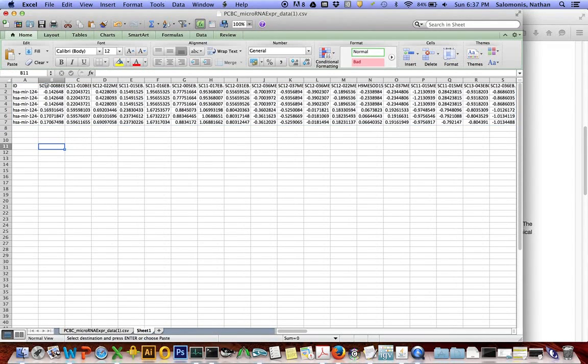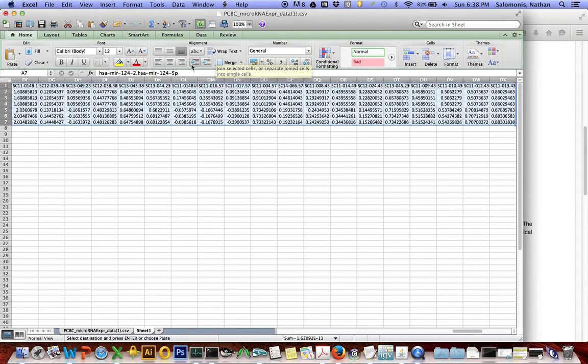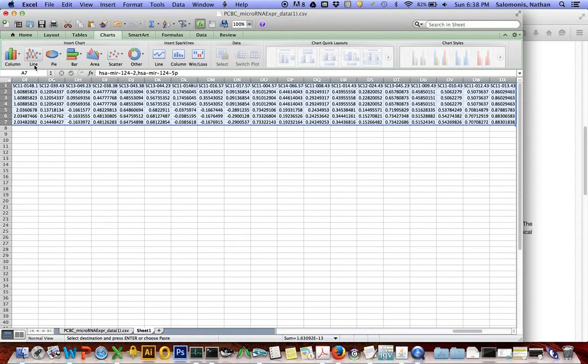There are a few because there are different versions of these microRNAs, 1, 2, 3, 4, 5' and 3' versions. And these samples are organized typically from embryoid body through the different differentiated lineages which are available within this compendium that we'll see a little bit more clearly in a moment.